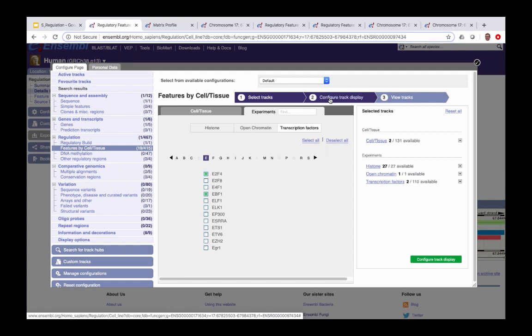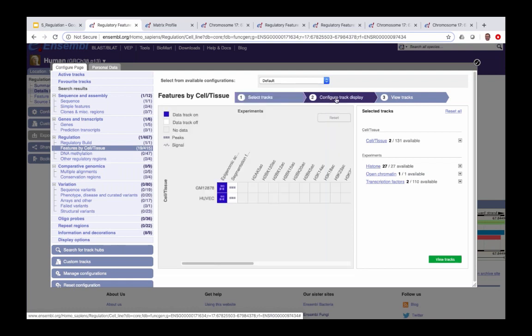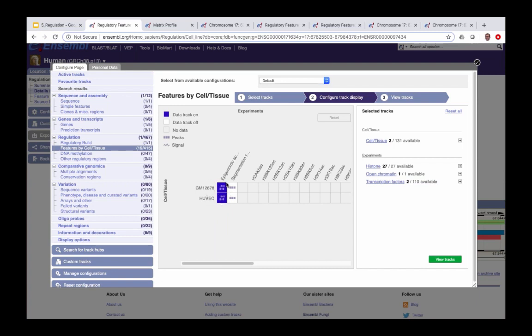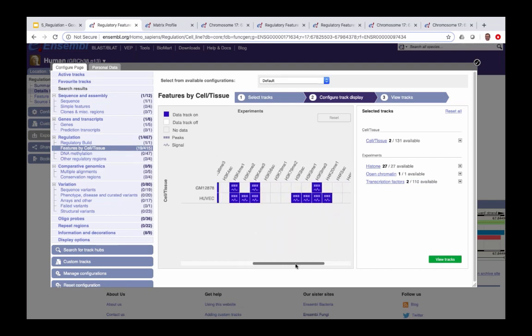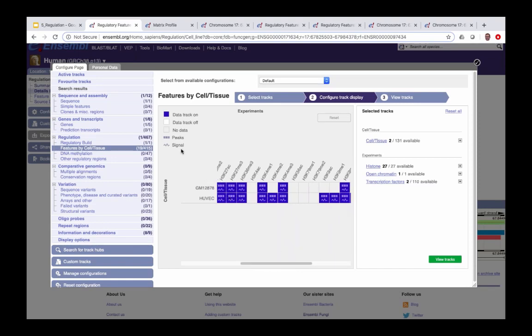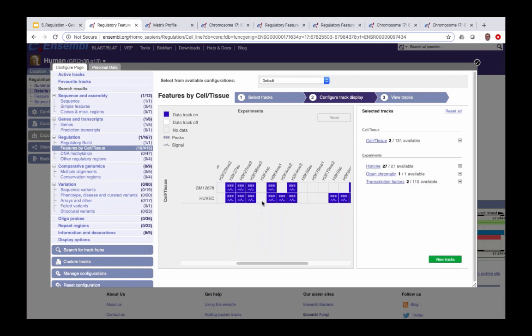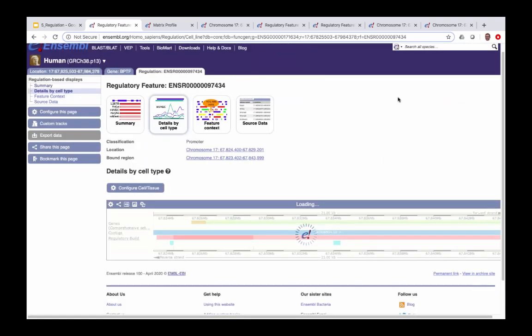The next part of the configuration is to click 'Configure Track Display' — step two in the flowchart. Here you can see a visualization of the different evidence types in the two cell types selected. For each evidence type in each cell type, we'll see both the signal trace and the peaks. When happy, click 'View Tracks' — step three — which closes the pop-up and reloads the page with your selected data.